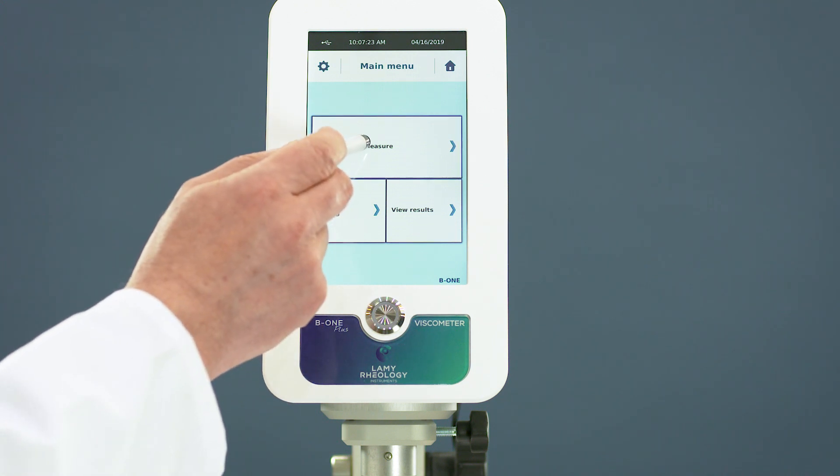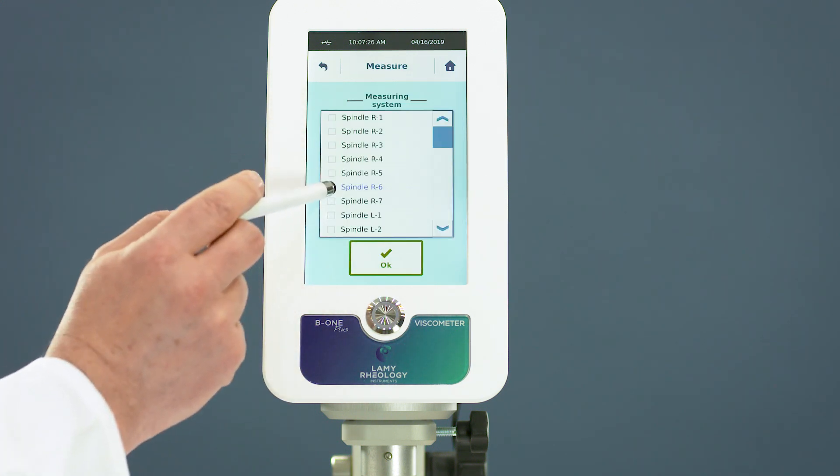You can now set your measurement. Choose the spindle, the speed, and the duration.